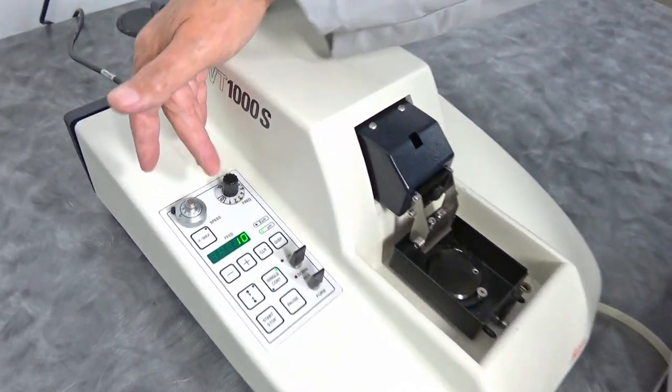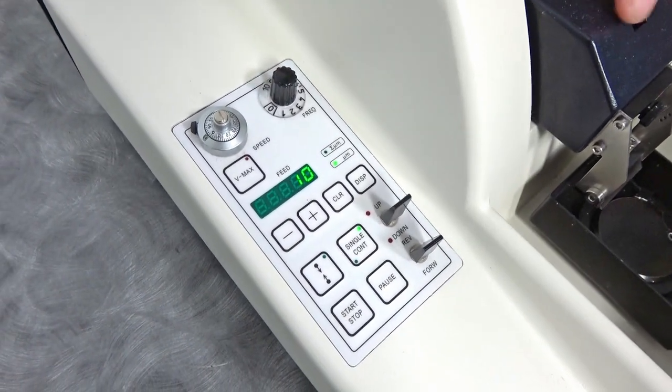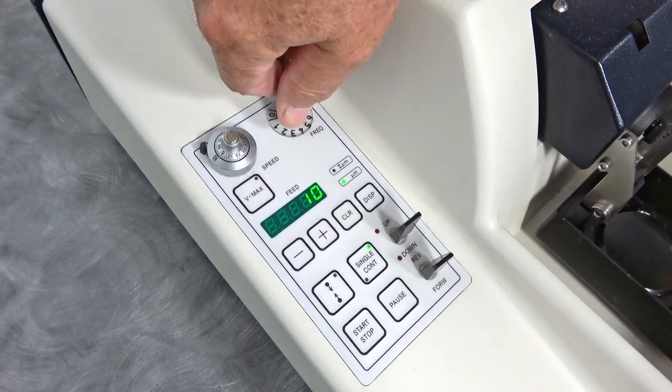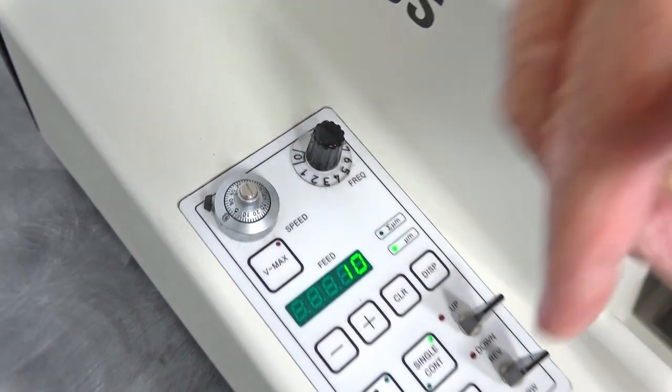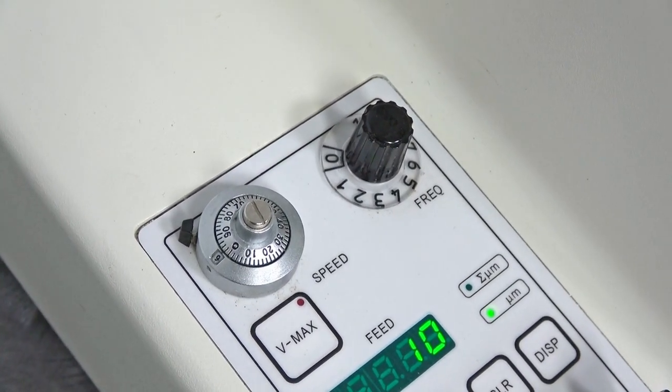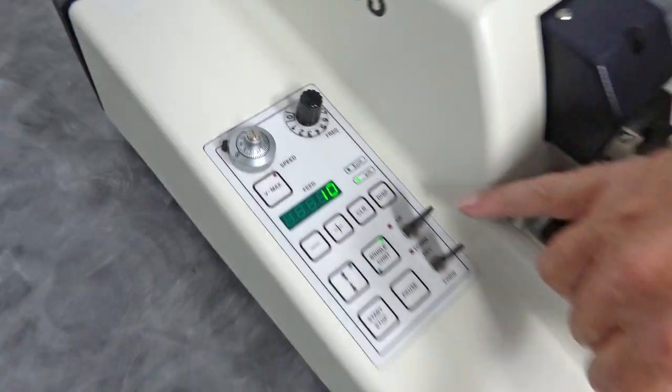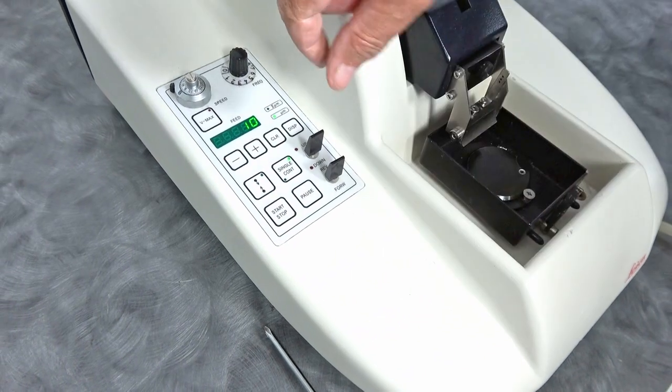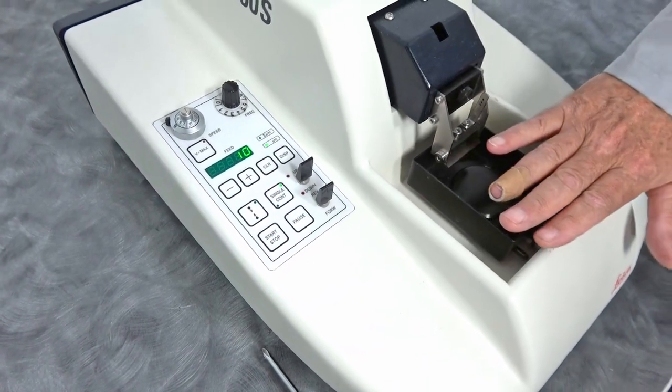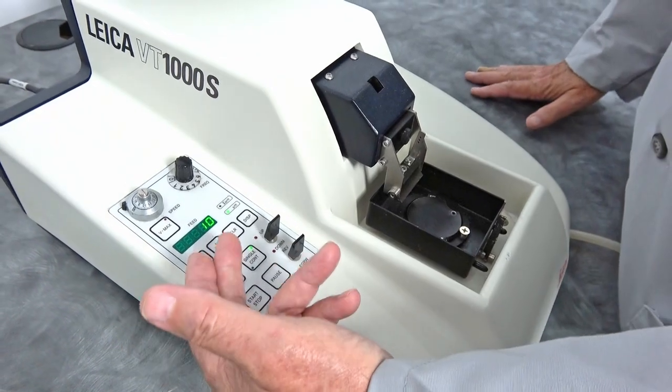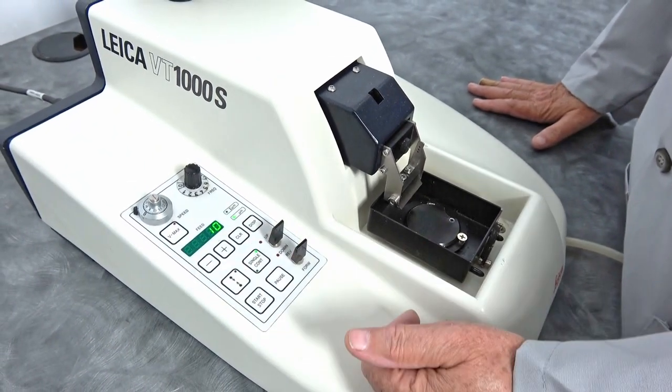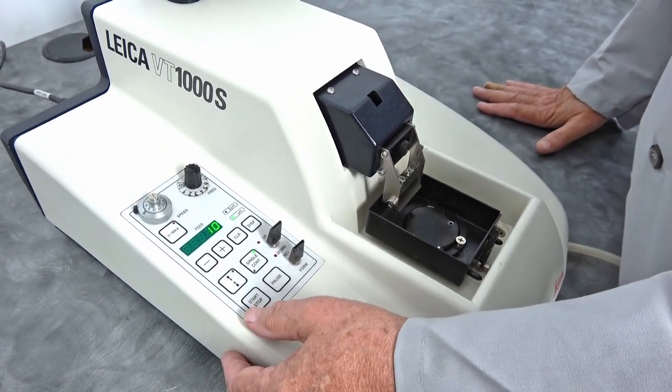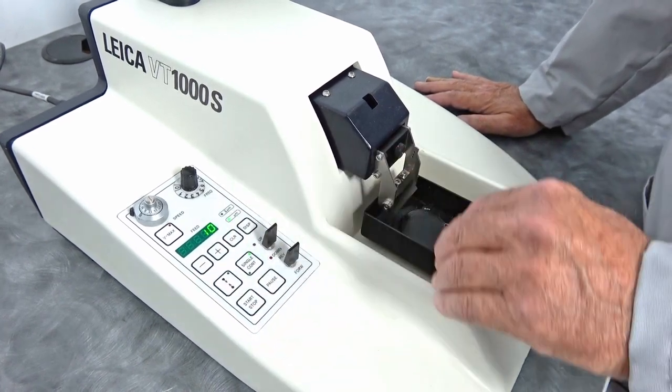On the controls, you can set the frequency of the vibration and the speed at which it advances the blade. Of course, you have your forward and reverse buttons and your up and down, which will raise and lower your stage. Once you've set your feed and frequency and everything that you want, you can press the start button and it'll go ahead and start.